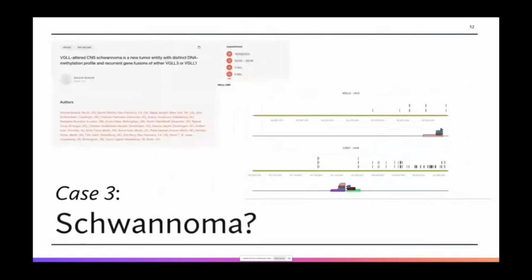And so we were able to go and look and identify exactly that fusion in our data, all within the 24-hour time window that we had set ourselves. So yes, very rare tumour types, but we get that additional wealth of information that we are after.